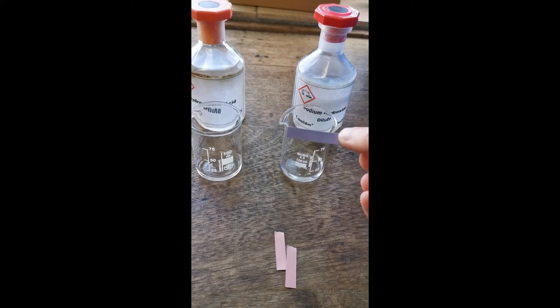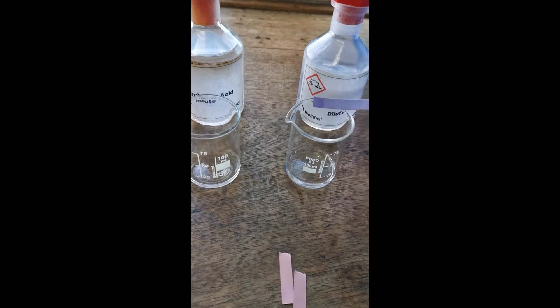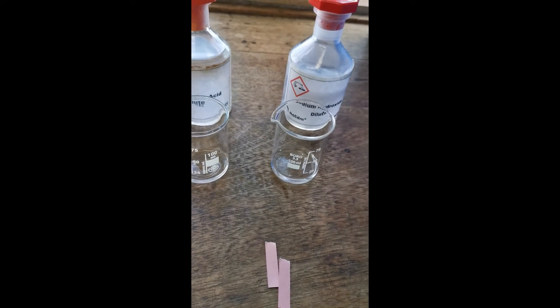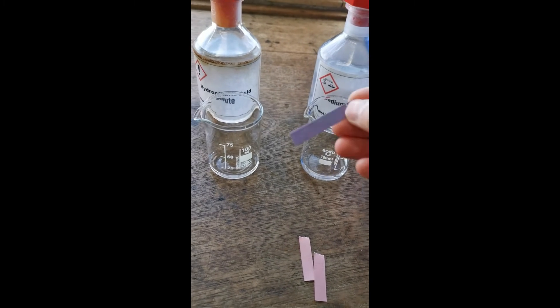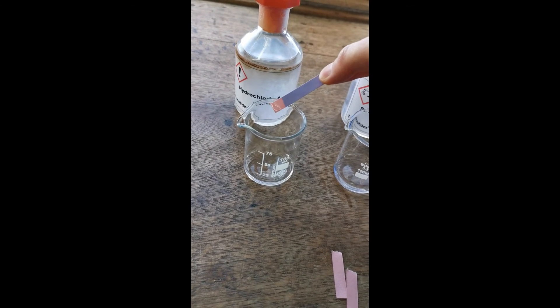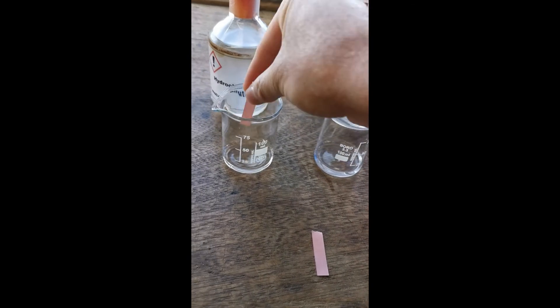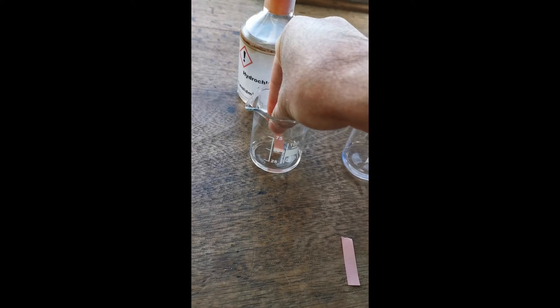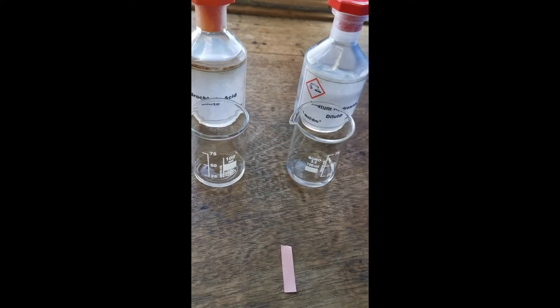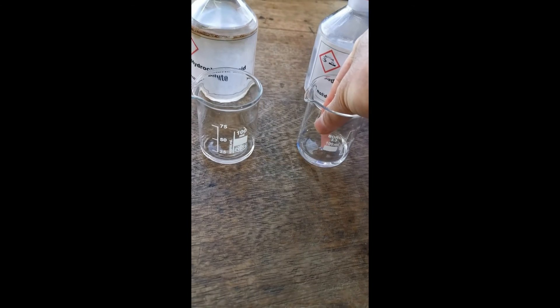Now I'm going to use the blue litmus paper, and as you can see in the alkali it stays blue. But in the acid it turns red. Similarly, when we use red litmus paper in the acid it stays red, but in the alkali it turns blue.